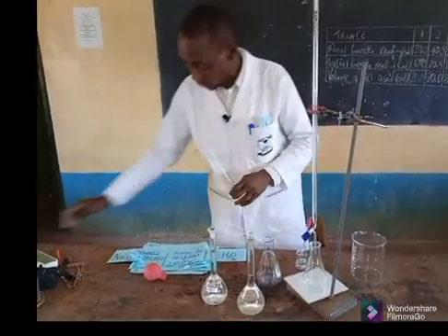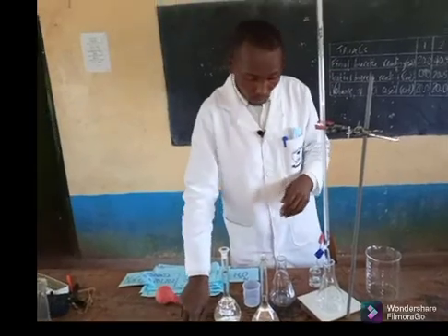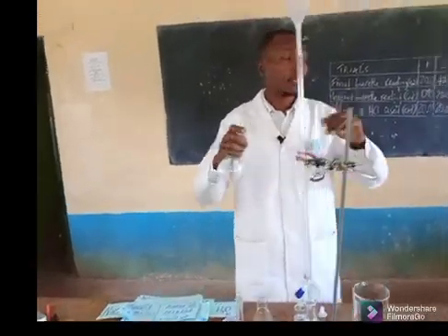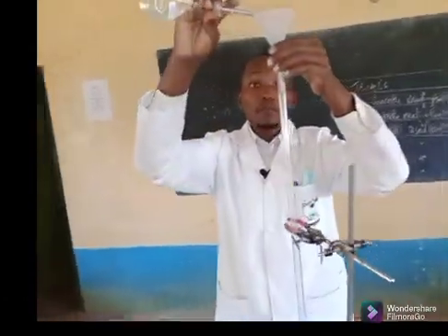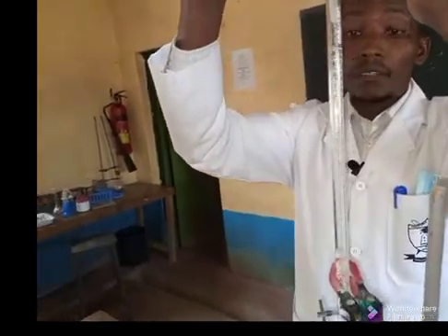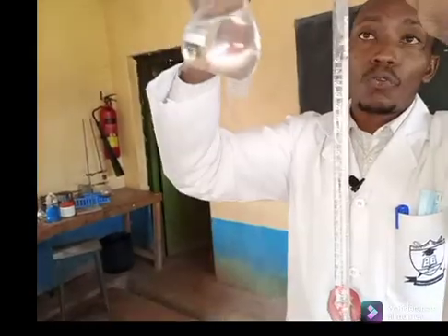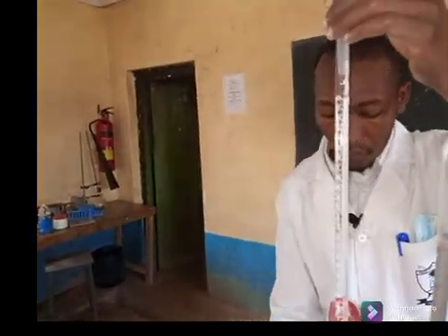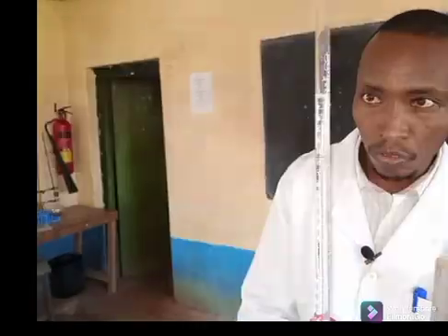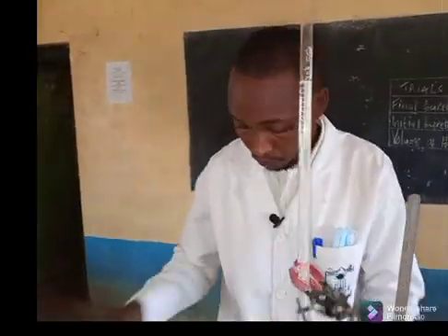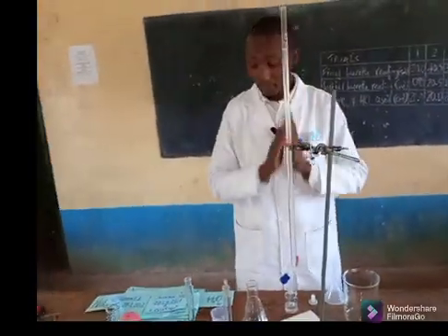To start with, I am going to fill the burette with hydrochloric acid. Always watch out and take care. I will adjust the volume — remember to read below the meniscus. I will adjust it to zero. I am at zero. So I have my acid in the burette.